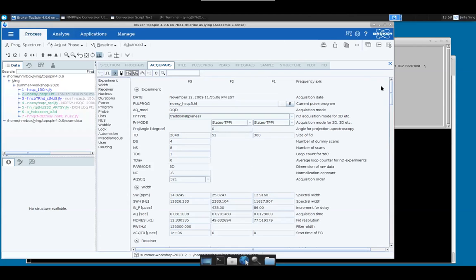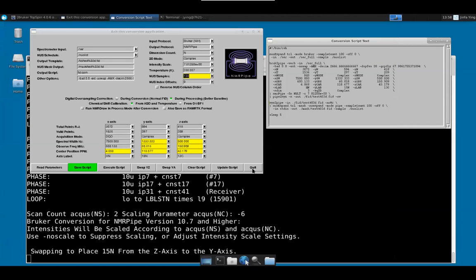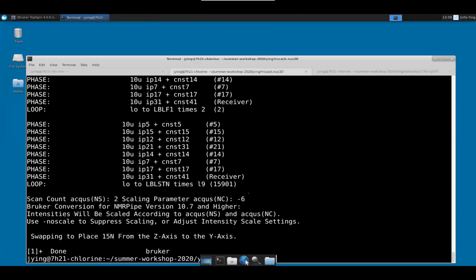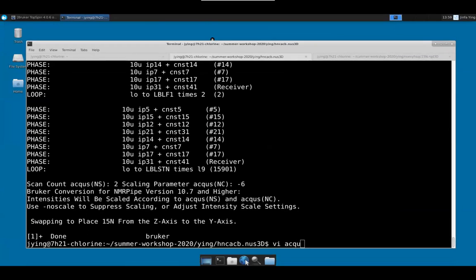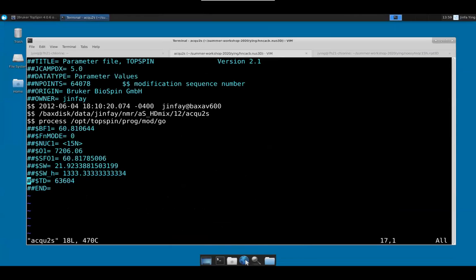But I think Frank nowadays actually could. Let me do a test like this. I think Frank talked to me about this, and we were able to do this. For example, let me edit this number and put this as 1, so it's a lot less data.